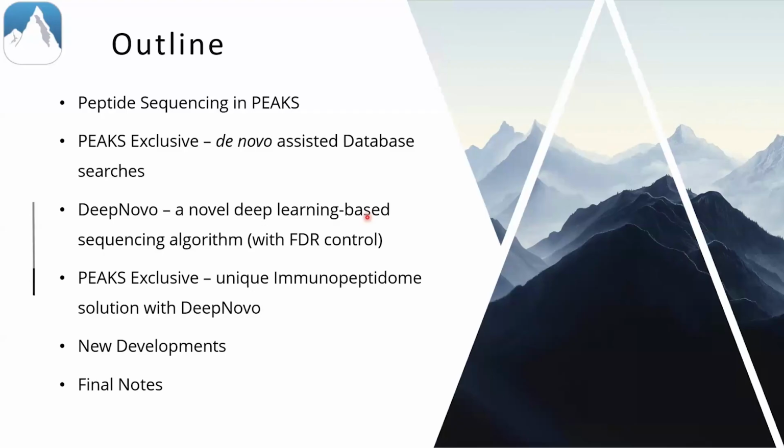We'll be focusing more so on the peptide sequencing in Peaks and some new developments, and then how we take advantage of these algorithms to enhance confidence and identifications in canonical and non-canonical peptide matches.